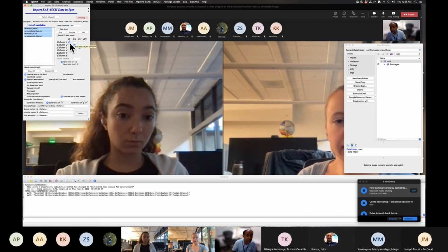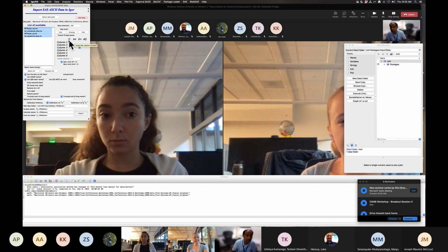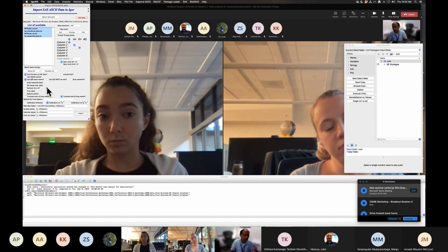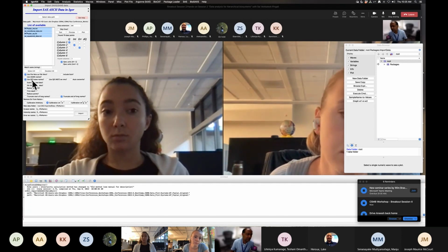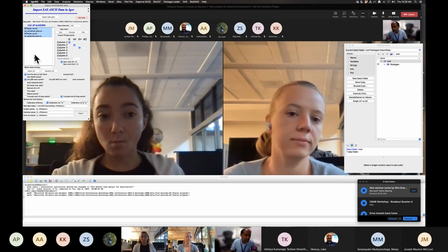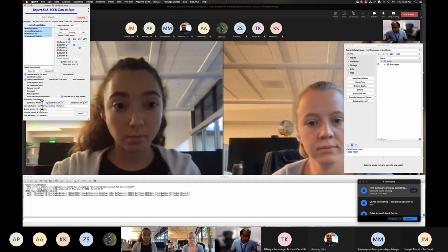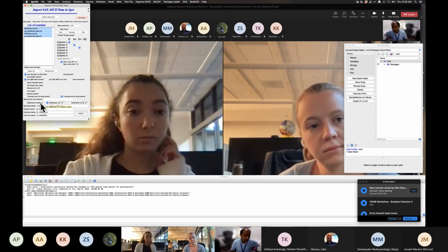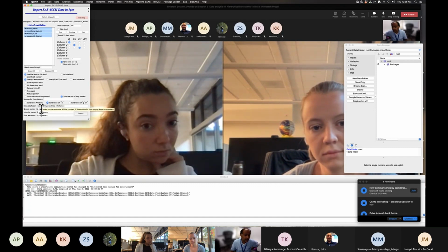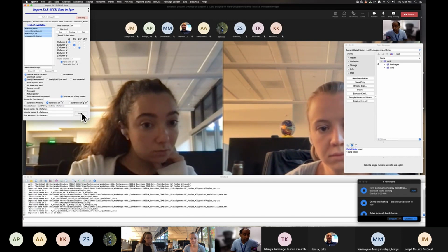Then you need to decide what columns to load it into, like Q, intensity, and error. For that, you need to click on test and then do that. I think you can read all this to figure out if you need them, but usually I don't change those options here. And then, of course, I clicked on select all to select all these, and also changed to calibration because our data was calibrated. That's it. And then I don't do any changes here and import. So you can see it's imported.